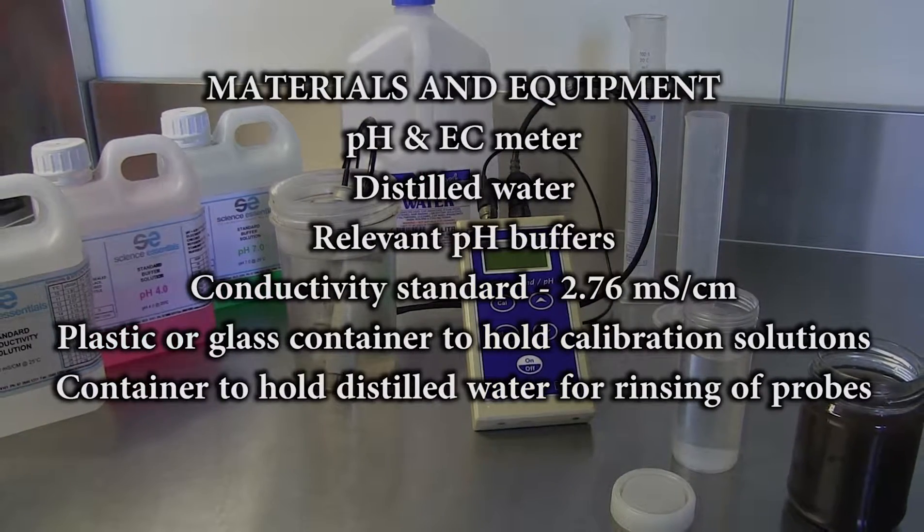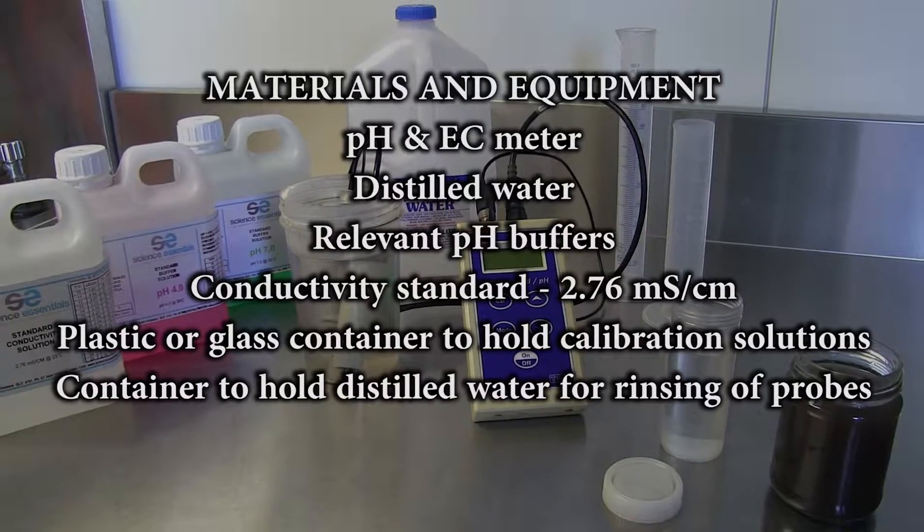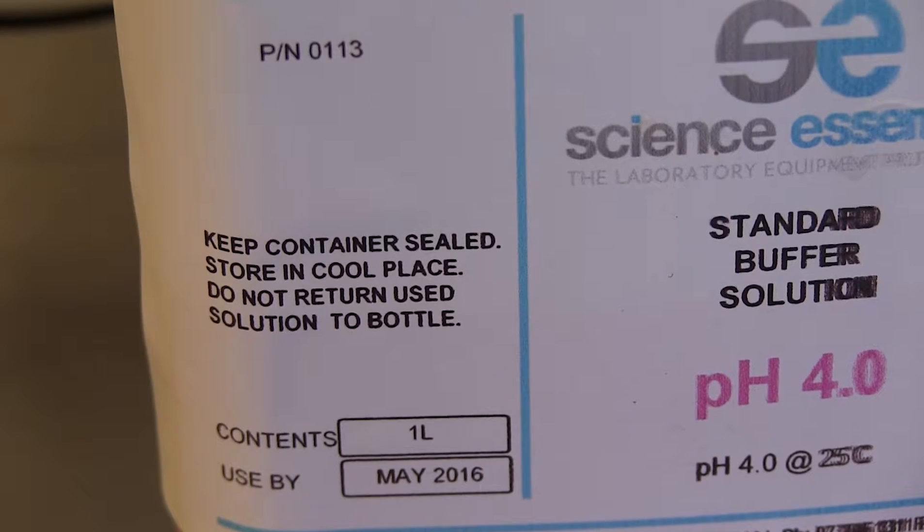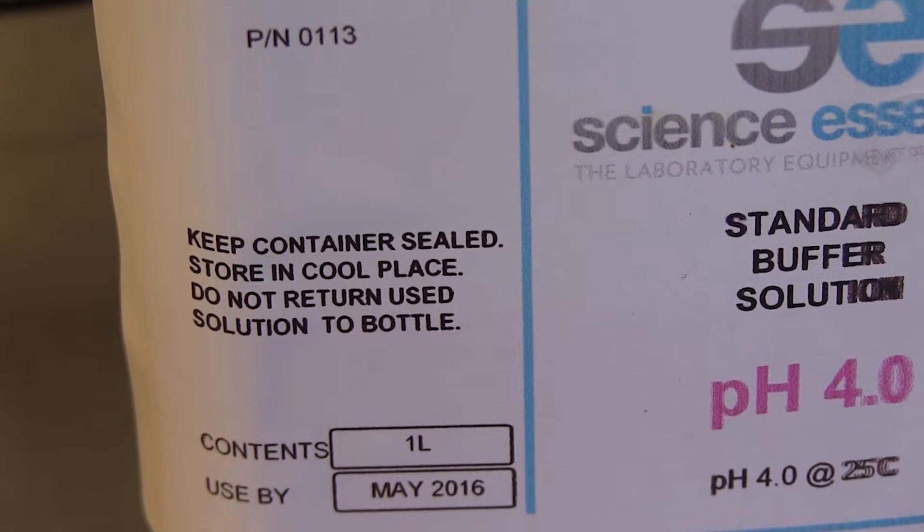The following is a list of basic materials and equipment required to successfully calibrate a pH and conductivity meter. If buffers require preparation before use, prepare the buffer according to the manufacturer's directions.